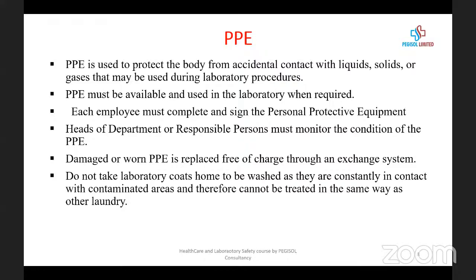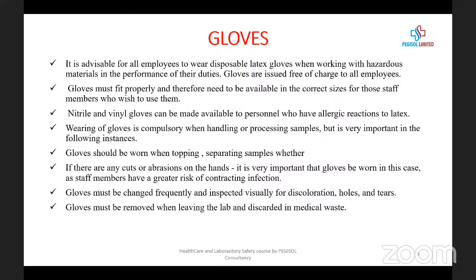Please note that for gloves, it's advisable for all employees to wear disposable latex gloves when working with hazardous material in the performance of their duty. Gloves are issued free of charge to all employees. Gloves must fit properly and therefore need to be available in the correct size. If you're wearing gloves, you don't wear oversized, and don't wear a size that's so tight. It must be your size.